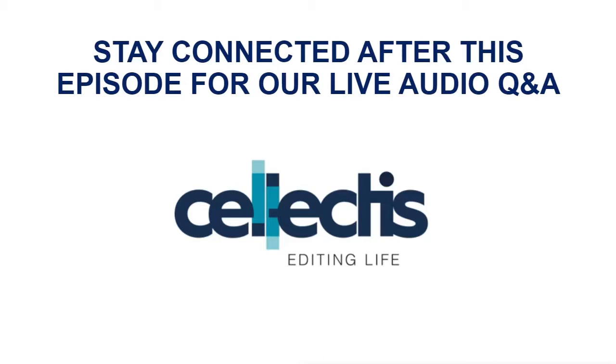Thank you, Simon, for this question. I am David Sourdive. I am a co-founder and executive vice president for strategic initiatives at Cellectis. So today we deploy the PulseAgile in GMP manufacturing for our clinical supplies of UCART products, and we can use it broadly for any cell therapy engineering. The requirements are the same as you would have for any kind of device that would be deployed in such a context. There are parts that are in contact with the product, and that's the electroporation chambers and possibly some tubings. Those have to comply with the classical requirements, leachable, extractable, and so forth, and compatibility with the product.